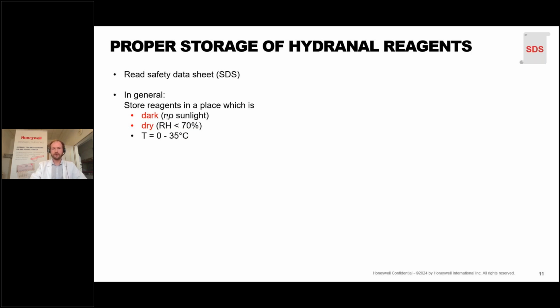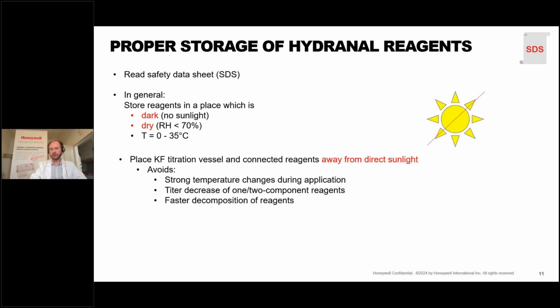Furthermore, we recommend to place not only the reagents but also the KF titration vessel away from direct sunlight. This will avoid strong temperature changes during the application and therefore also reduce the titer decrease of the KF reagents. And finally, you will also avoid an accelerated decomposition of the reagents.